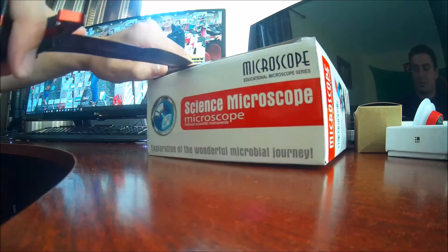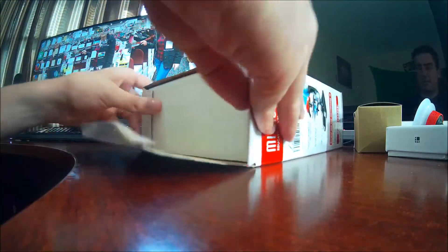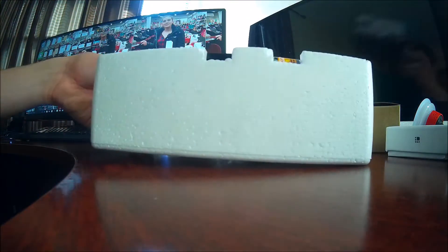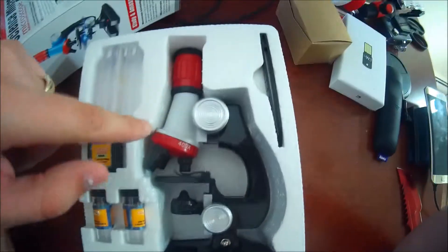Alright, so let's go ahead and get that little piece of tape here. Let's see what's inside. I guess I want to turn it this way so I'll be pulling it out. Alright, let's take a look. You have the awesome microscope.